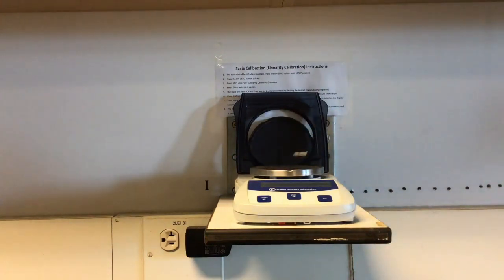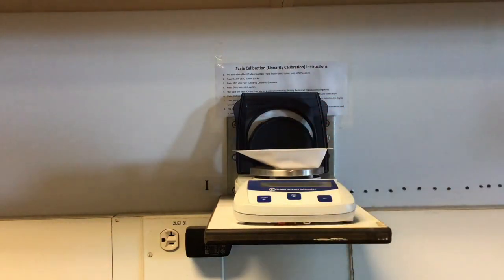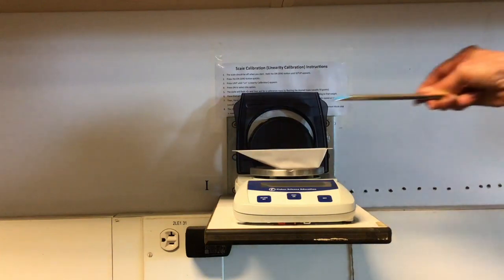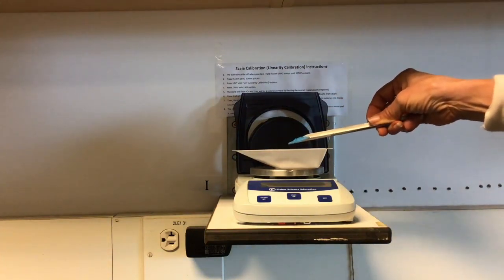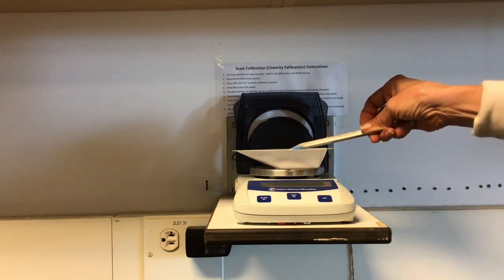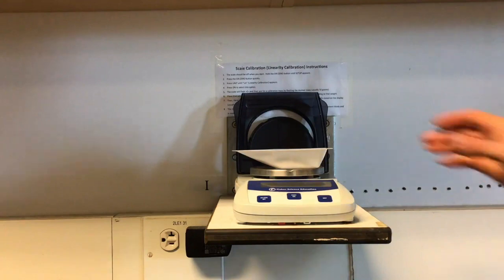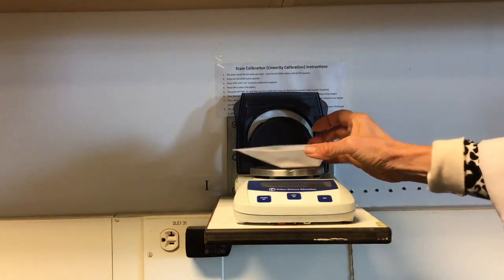I'm going to save that for one of my test tubes to add to water, and then I'm going to get another weighing boat, tare that, and then I'm going to add the same mass as I weighed of my crystal, my 0.864 grams. Now I'm ready to dissolve it in water.